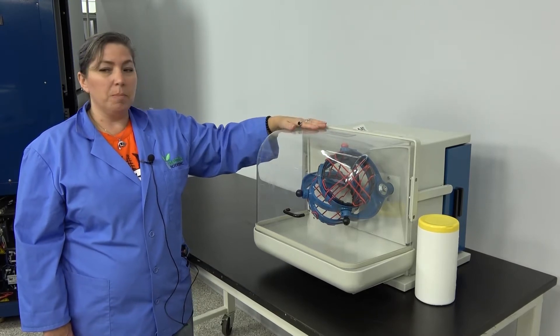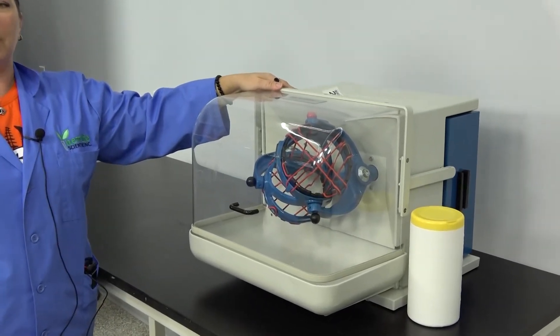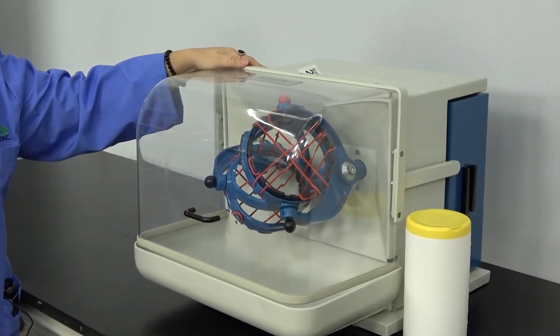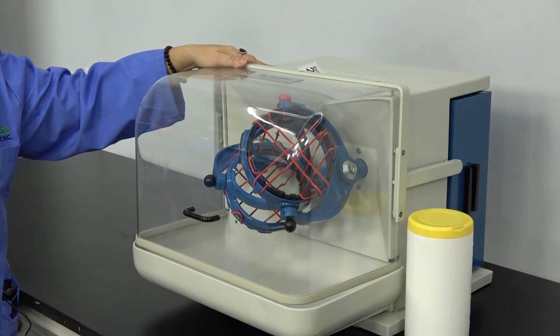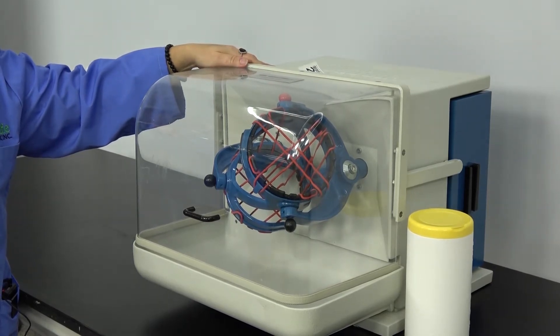This particular blender is used to mix powders and substances of differing weight and particle sizes into homogeneous mixtures. A lot of times it's used in the pharmaceutical and other chemical industries.